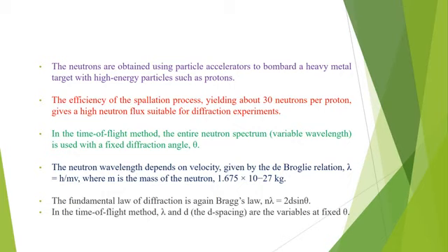The fundamental law of diffraction is again Bragg's law, which is n lambda equals 2d sine theta. In the time of flight method, lambda and d, that is the spacing between the layers, are the variables at fixed angle theta.